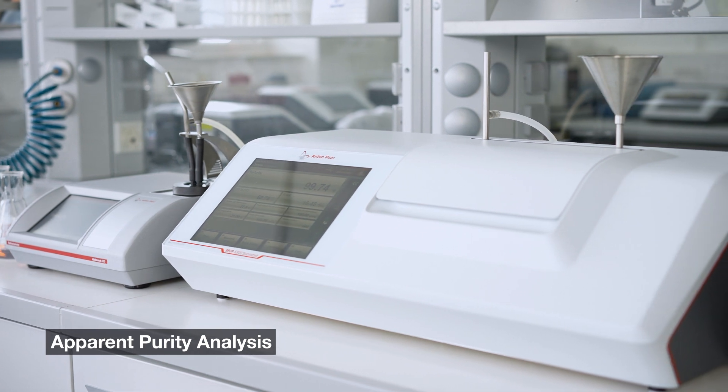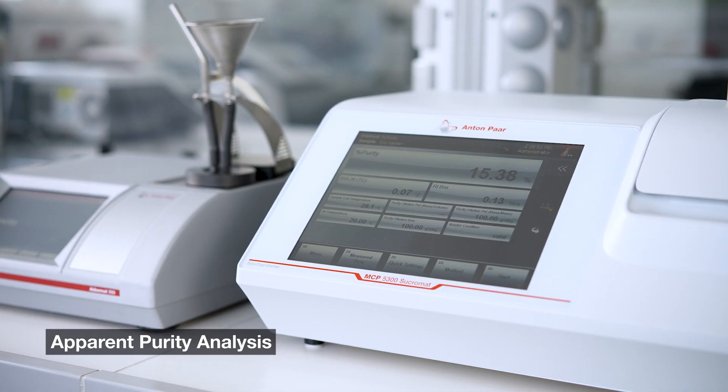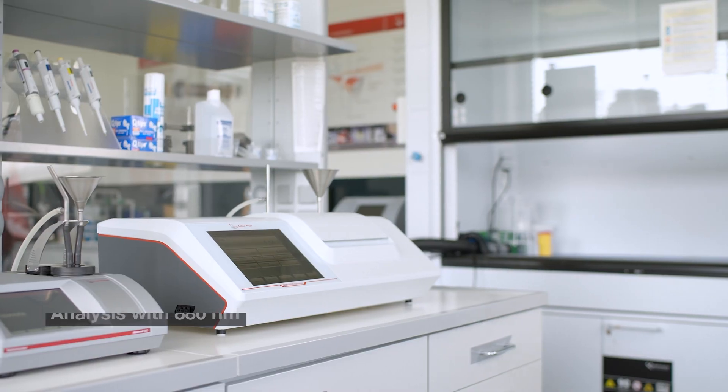For quick, smooth, all-in-one analysis of sugar content, dry substance and apparent purity.